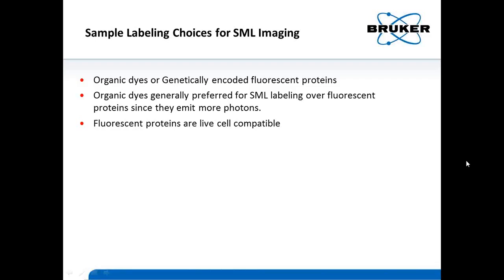But on the other hand, fluorescent proteins are more physiologically relevant, and they're more live cell compatible. So there are advantages to both, and people have been picking whatever works for them in order to be able to do the experiment that they want to do.